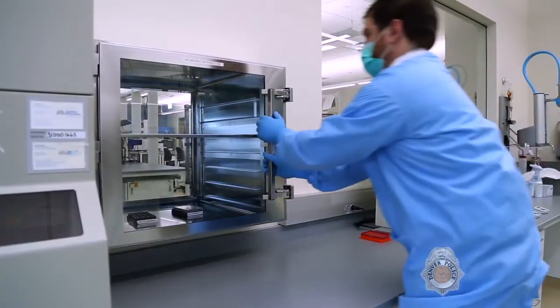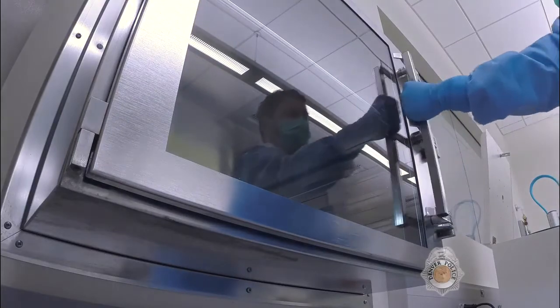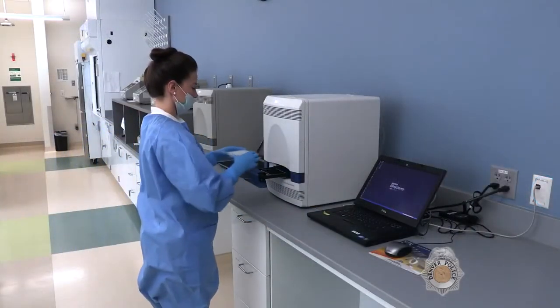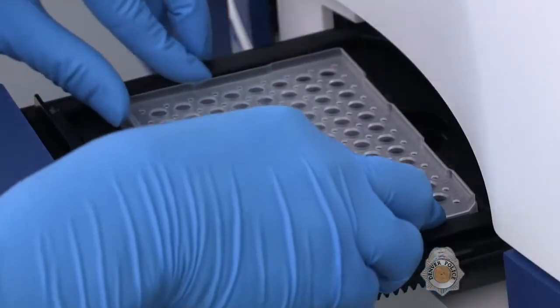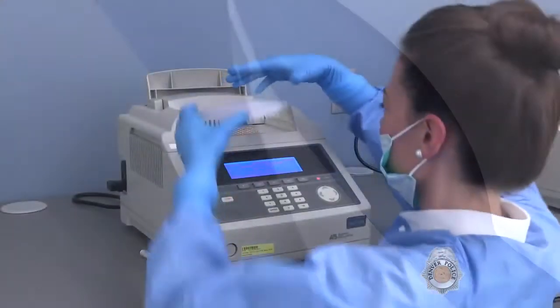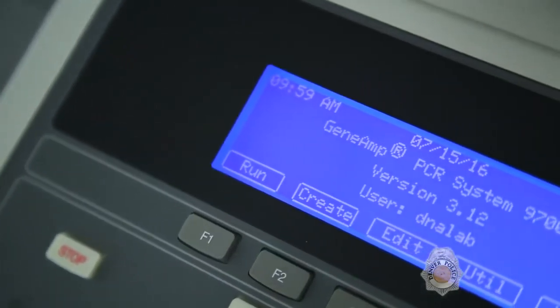After extraction, samples are passed through a secure chamber from the pre-amplification to the post-amplification laboratory. The next step is DNA quantitation, which determines how much DNA is present in each sample. That's followed by an amplification step, where the DNA is copied millions of times.